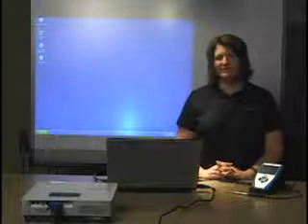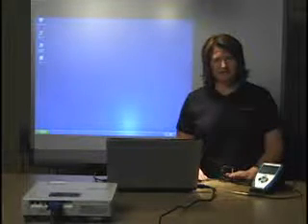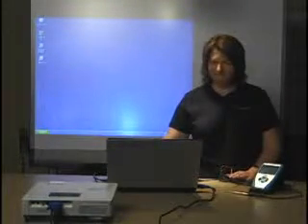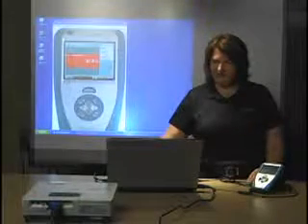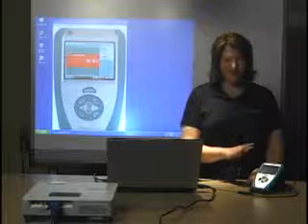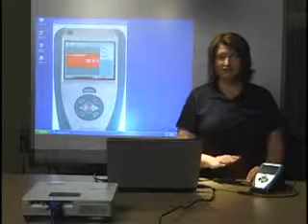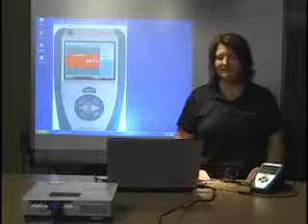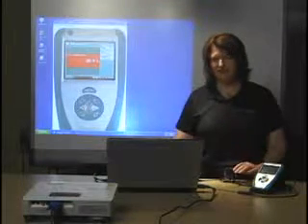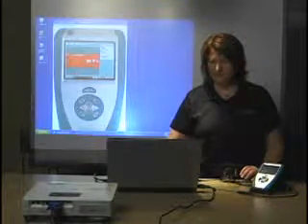So the LabQuest Emulator software itself actually lives on the computer, and I'll launch it now. Okay, so the software's been launched. We'll scoot it up here. So you'll see that the LabQuest unit itself has the computer connection screen now, and the computer emulator software is showing the live screen of the LabQuest. You're going to do all your control here from the computer with your mouse.